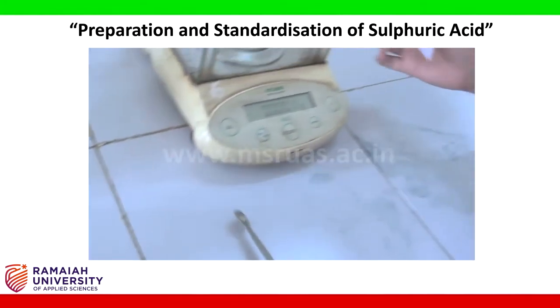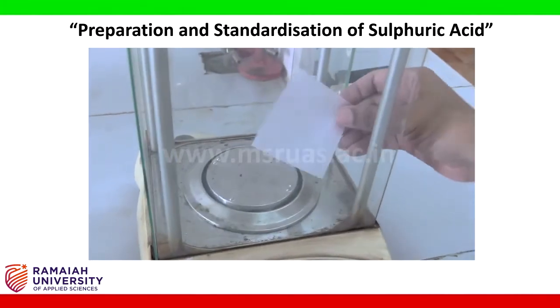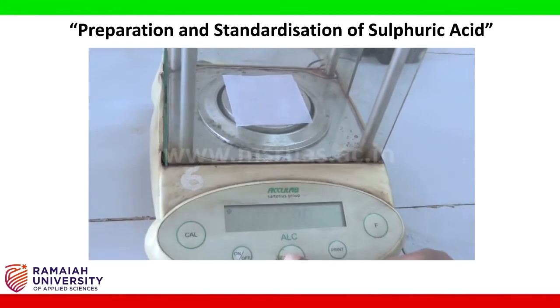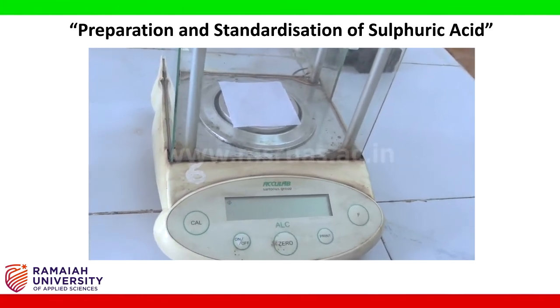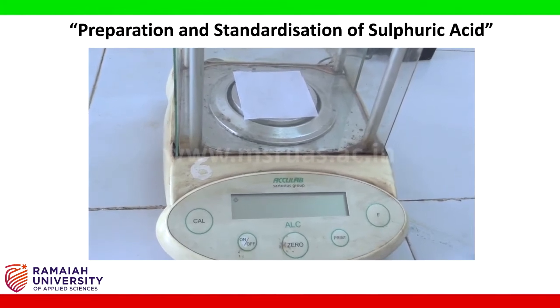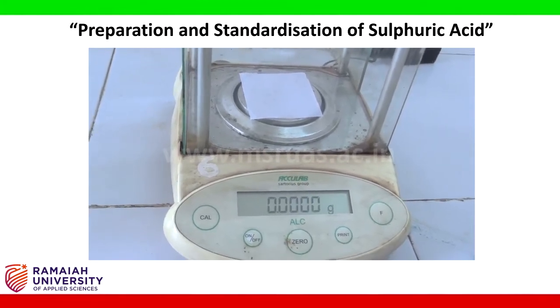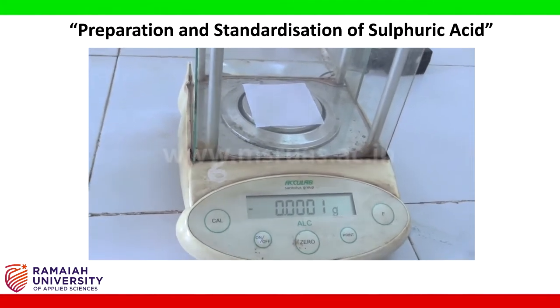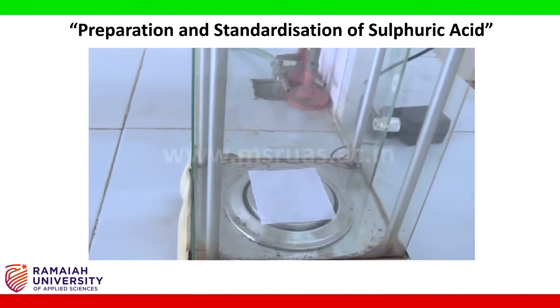Take the butter paper and place it on the pan and make it to 0. Weigh 0.53 grams of anhydrous sodium carbonate.